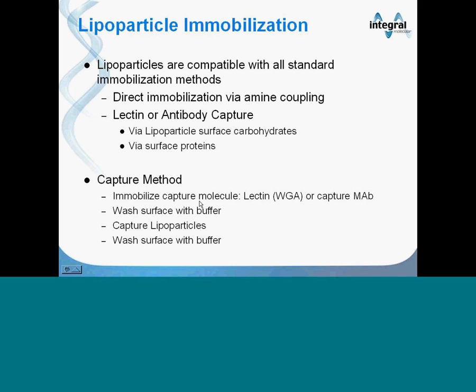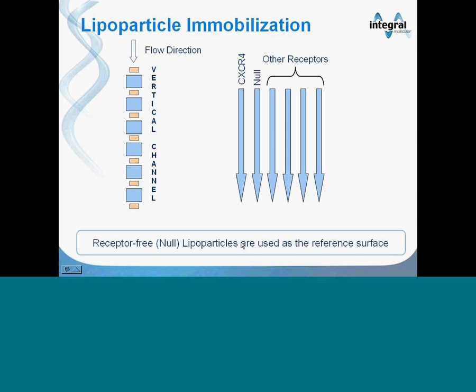We call our control lipoparticles nulls, and what null means is that these are receptor-free lipoparticles that are made the same way the receptor-bearing lipoparticles are, except we don't transfect in the DNA for the receptor. These are really the best thing to use as a reference in the experiments.